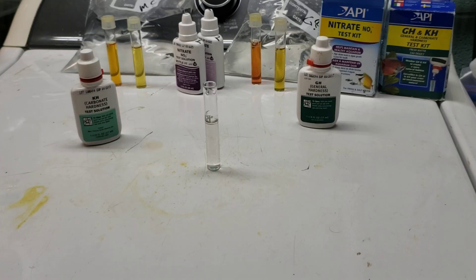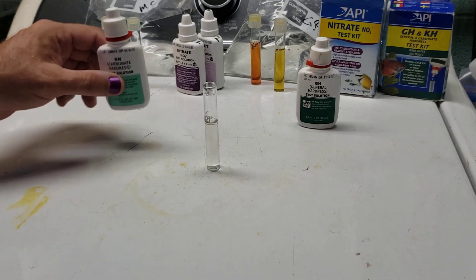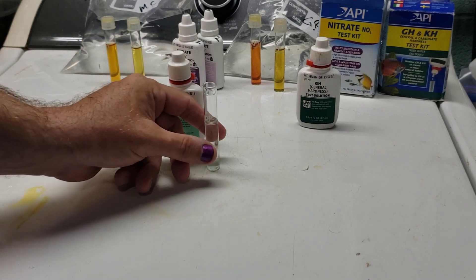Hey everybody. Today we are going to talk about how the API Carbonate Hardness Test Kit works. It works very similar to the General Hardness Test Kit, but I can't show you how that works because I have very, very soft water — zero degrees hardness — and we never get a color change. But with the Carbonate Hardness, we should get a color change.